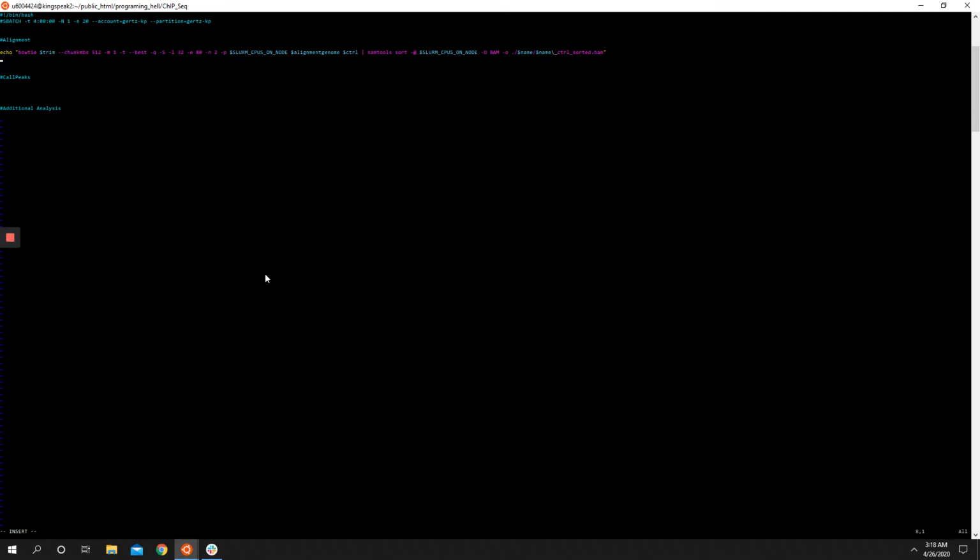Okay, so first of all, on the command line, obviously you can give it a program like Bowtie, and then Bowtie will take in arguments, and a lot of times programs like to break up those arguments with things called flags. Typically what you see with either 2 dashes for long arguments or 1 dash for short arguments, these are flags.